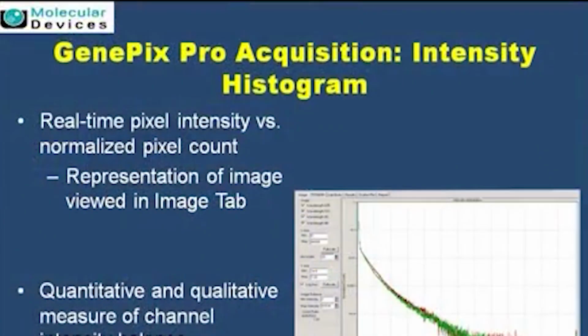Yes. So basically in the preview scan, when you are scanning your live data, you can just switch to the histogram graph. What it gives is how much the red and green channels are contributing towards the intensities. So you really want them to be overlapping, so they are really balancing. There could be a small variability in the beginning owing to the fact that there is just background and then the spots coming in. So you want them to be overlapping after a little bit of lag, that is, a few seconds of lag.